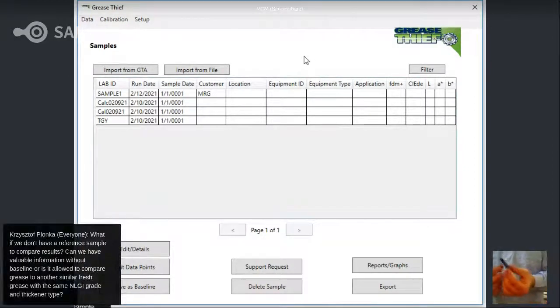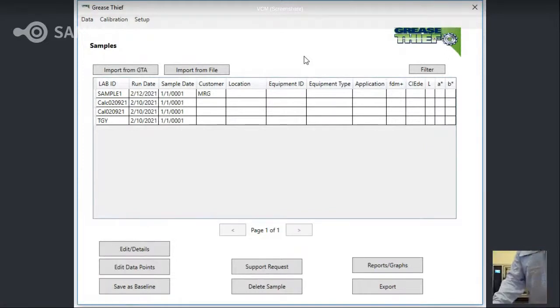All right. So we're ready to prepare this sample for die extrusion. So I'll take you guys back over in front of the analyzer. So again, have the grease thief with its cap off, the extrusion die, and we're simply going to thread the two pieces together.